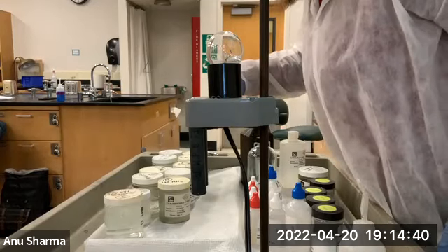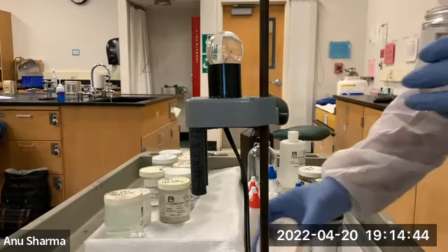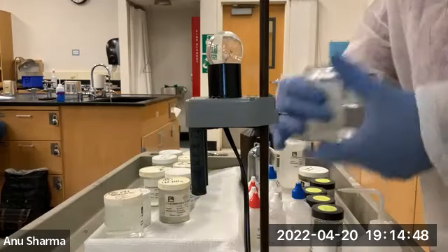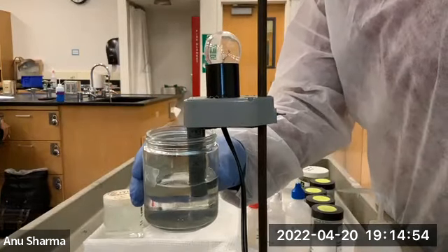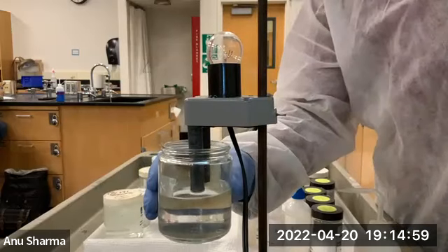Okay, now let's look at the C2H5OH. I just cleaned it, and now I'm putting this here. See, we need ions for the bulb to light up.